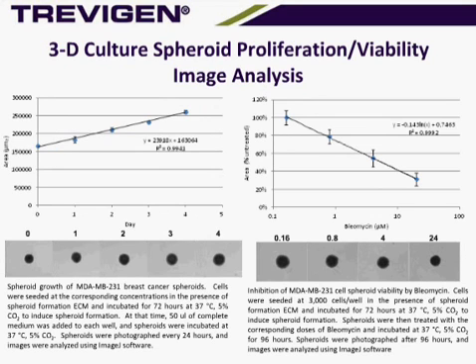Okay, and we can also look at spheroid growth over time, as well as inhibition of growth using this technique. On the left, we see spheroids. This measures the spheroid area. Right below the graph are pictures of the spheroids themselves, and we see that the spheroids expand over this 4-day assay. And we also see nice, tight error bars with these measurements.